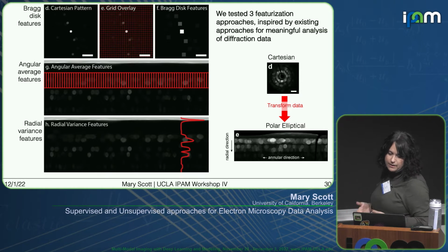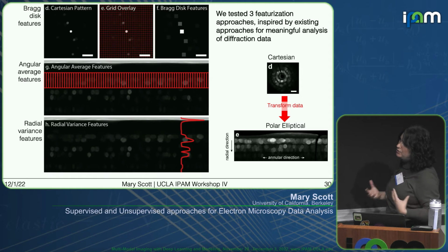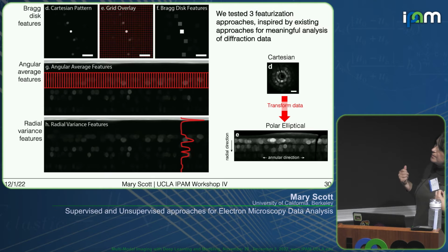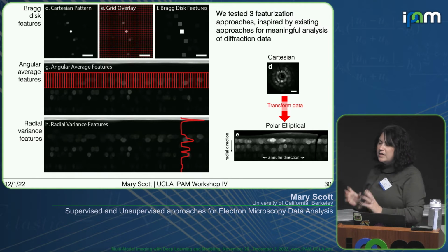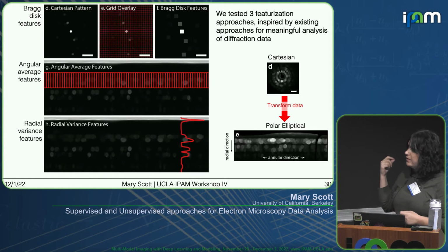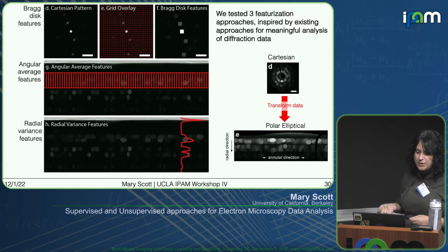And essentially, you can think of this as majorly downsampling our diffraction pattern and turning what is really a disk with an intensity and maybe some intensity variation inside to a single pixel with an intensity corresponding to it.